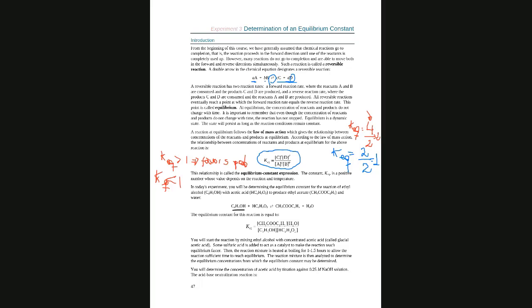But why did they use this reaction here? Only because it's a reversible reaction and it's possible to calculate the equilibrium constant. But you are not supposed to know the details. This is called a Fischer esterification.